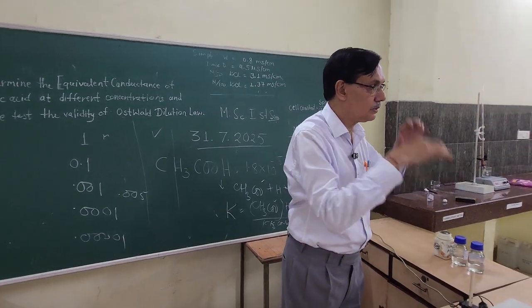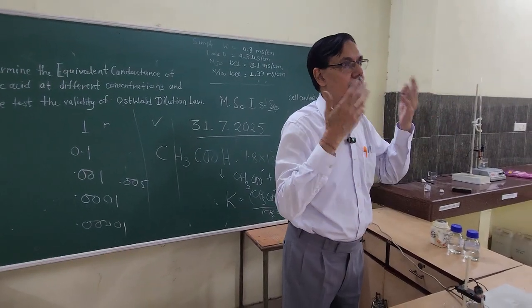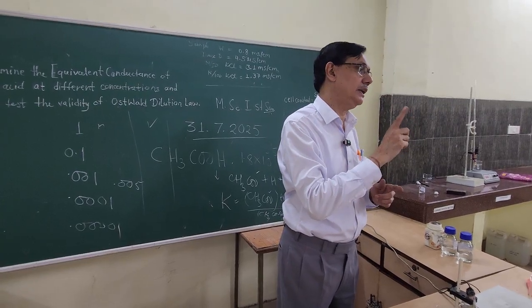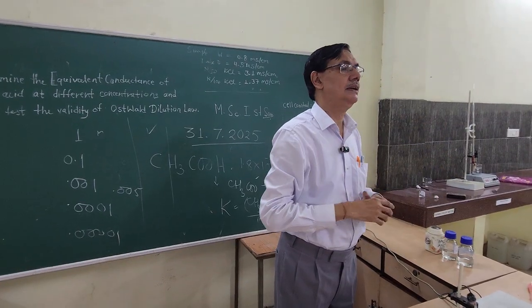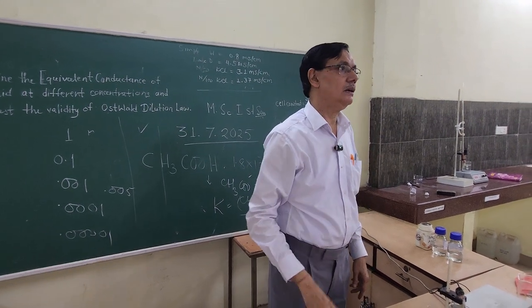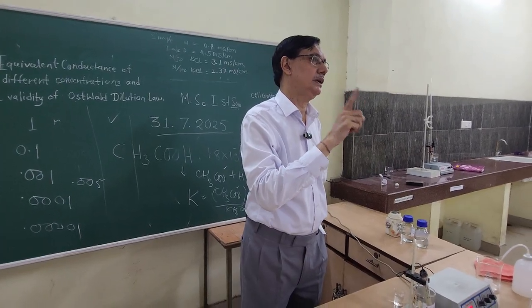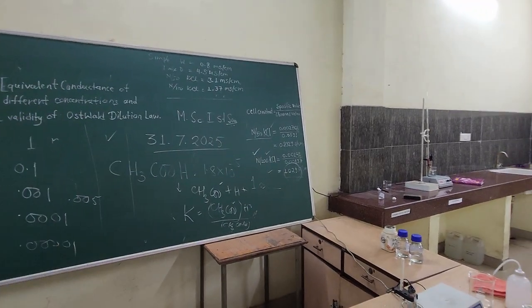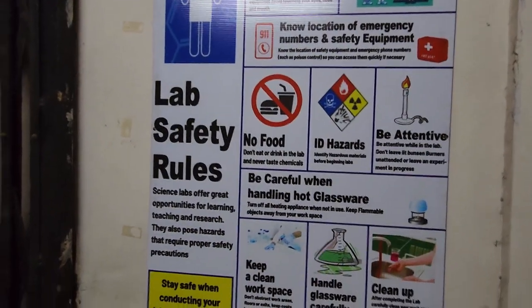एप्रॉन आपके पास होना चाहिए, ग्लव्स होना चाहिए, फिर आपके पास वो ग्लास भी होना चाहिए, चश्मा भी होना चाहिए ताकि कोई केमिकल्स आपके यहाँ पे ना जाए. Precaution, lab safety is very important. अब बाहर में भी हम अभी आपको लैब सेफ्टी का भी दिखा देंगे. और इस तरह से आप लोग अभी मेजर करेंगे. एक दो इन्होंने रीडिंग लेंगे. उसके बाद कल हम किसको करेंगे? हाँ, the pH calculation and the pK of benzoic. थैंक यू वेरी मच. आप वो लैब सेफ्टी का भी थोड़ा दिखा दीजिए एक बार. आप लोग काम करिए, आप मेजर करिए. अब बंद कर दीजिए. थैंक यू.